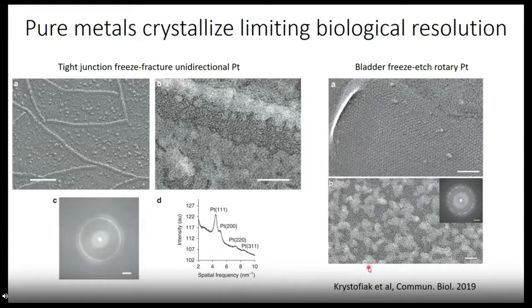We did this similarly with the luminal surface of the bladder epithelium. This has that uroplakin 2D crystal. That's a very useful tool for understanding resolution. Here we did a rotary shadow, and here's the uroplakin complex. See, they should all actually be completely uniform to one another, but we can see that the platinum did not deposit uniformly, and this is again due to crystallization.